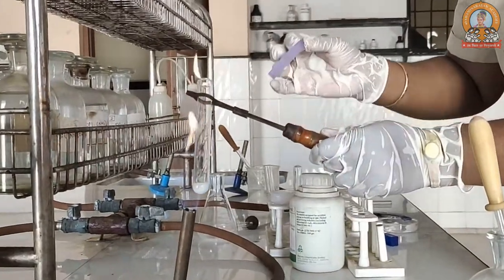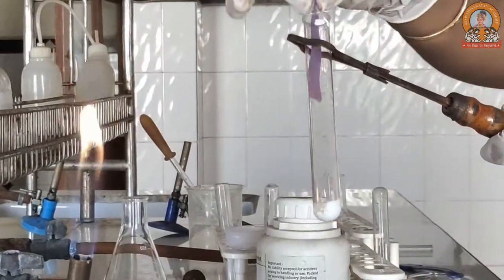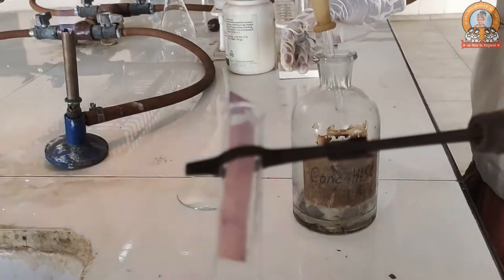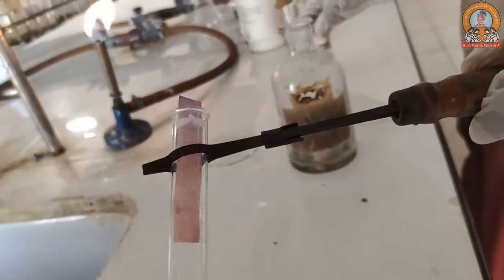We have a moist blue litmus paper with us to see whether it is showing any change or not. You can see the blue litmus paper turned red — that shows acetic acid vapors are emerging.